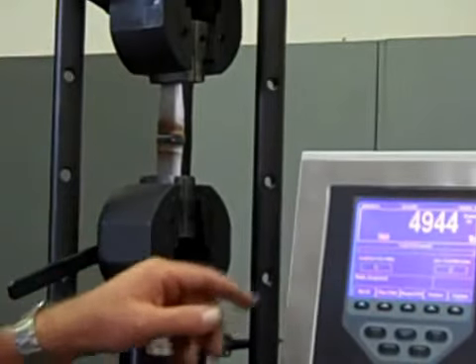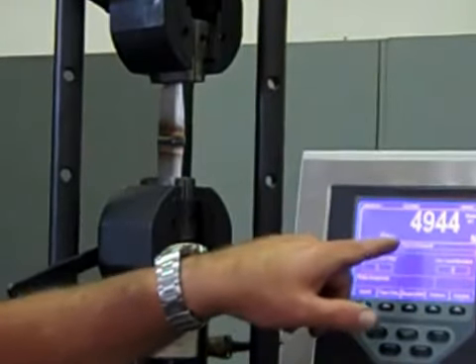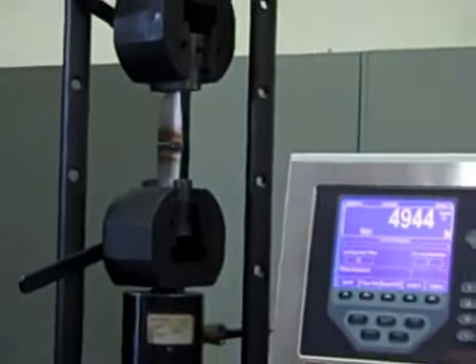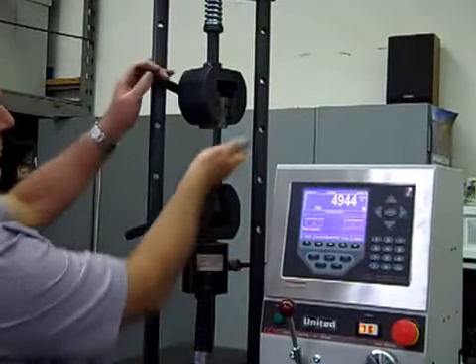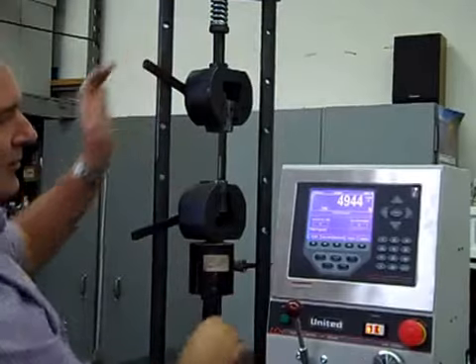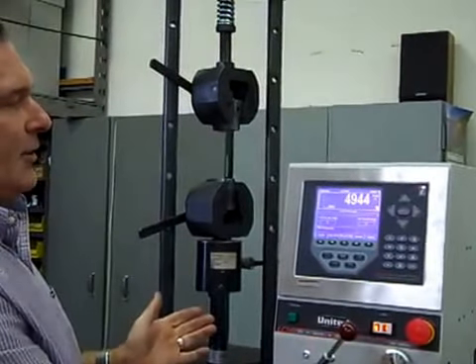All right. The sample is broken. It broke in the grips. 4,944 pounds, peak force. The machine is put in neutral. The sample is removed. The machine is returned back to zero.